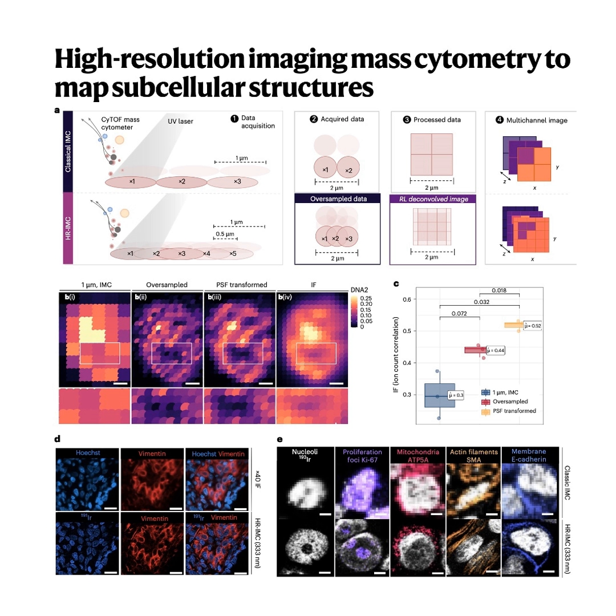And what did that organelle-level comparison tell us about the different cell types in the tumor microenvironment? They found that tumor cells displayed a higher mitochondrial density and larger, more interconnected mitochondrial networks than the neighboring fibroblasts or immune cells. So this confirms known metabolic differences, but now you can actually see the architecture underlying that difference. Right. And crucially, they were able to correlate specific metabolic states with organelle content. You mean they found the Warburg effect happening right before their eyes?